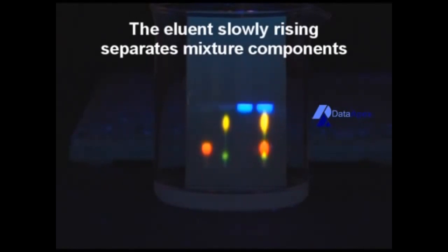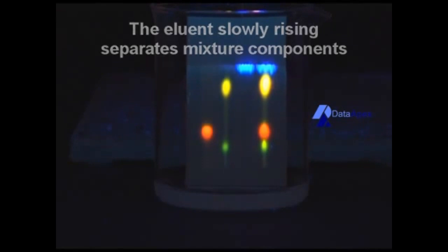By applying the TLC technique we can find that the mixture contains three spots. The first spot from the bottom is the orange one, then the yellow one, and then the blue one. So we use qualitative TLC to determine the components of the mixture.